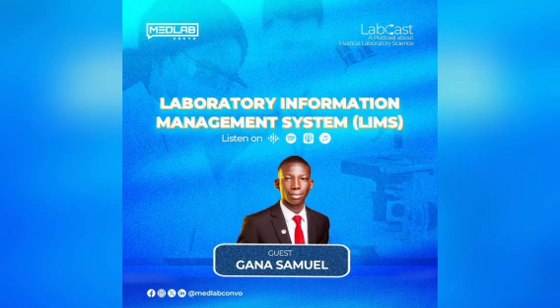So this is one thing I believe that we can do. Then again, it's not too late for anybody to learn how to become technology savvy. That's what I believe. And I also believe that one thing with this data is that we should just start. And when we start, at some point we finish entering all our data into LIMS, and the benefits are enormous.